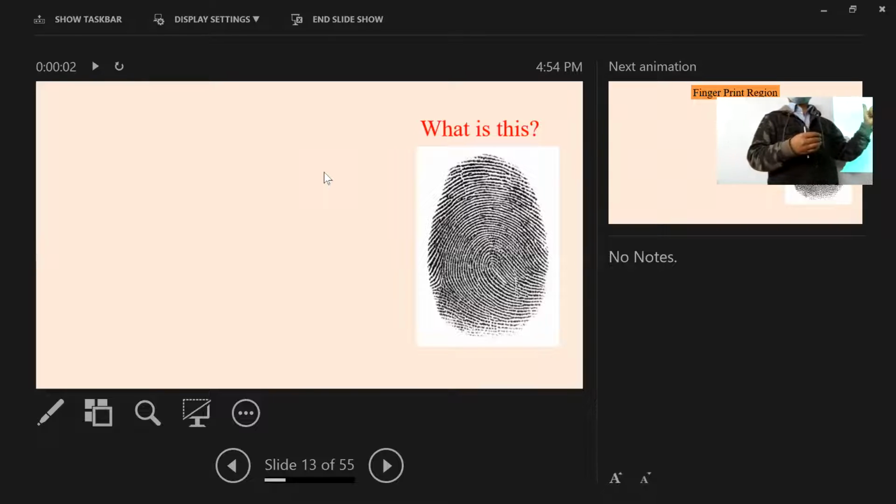each has a fingerprint which is completely identical for me, different from others. If we consider that fingerprint, we can easily identify one person.